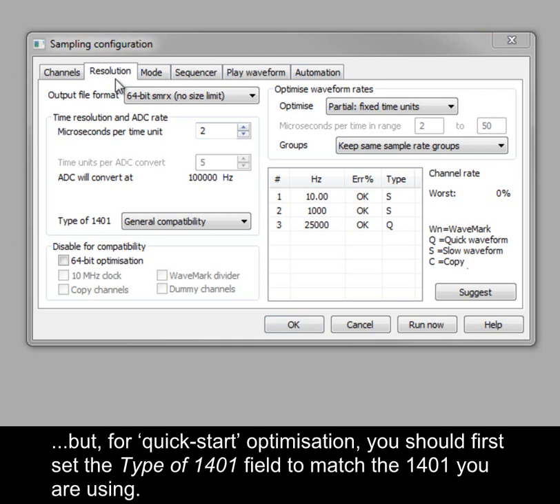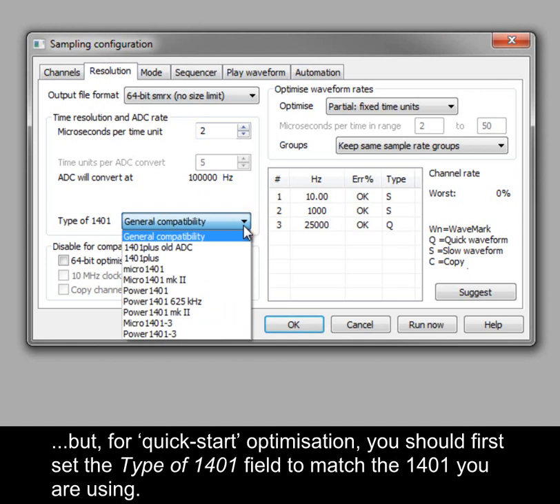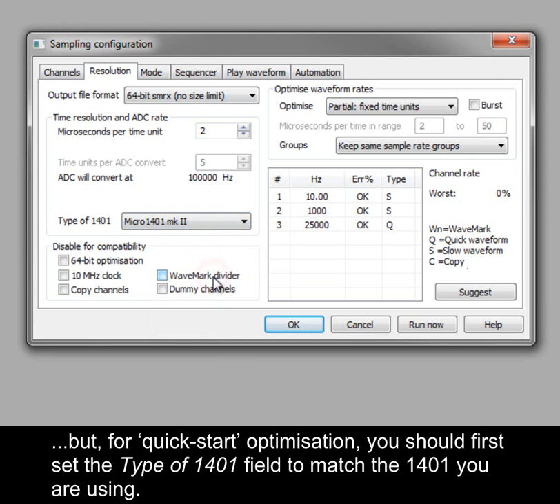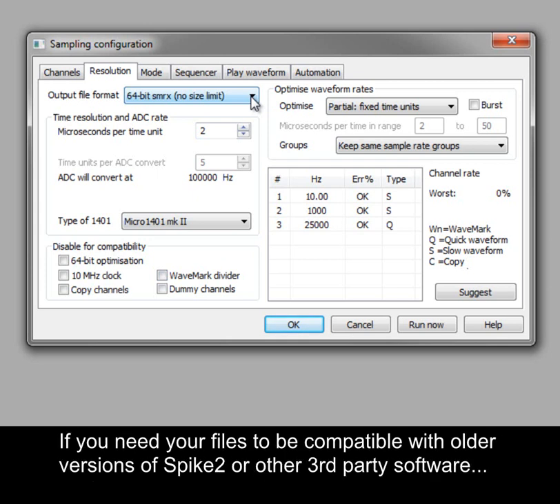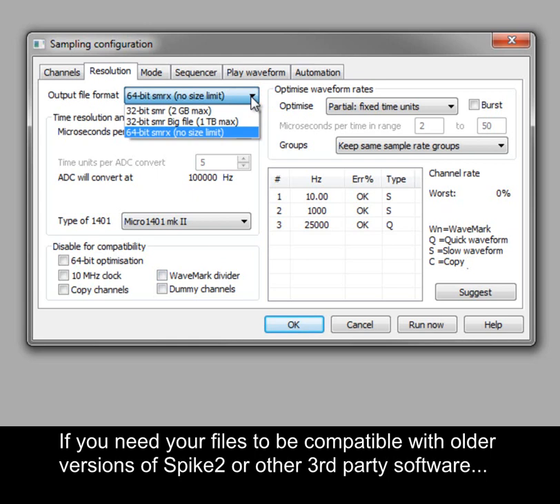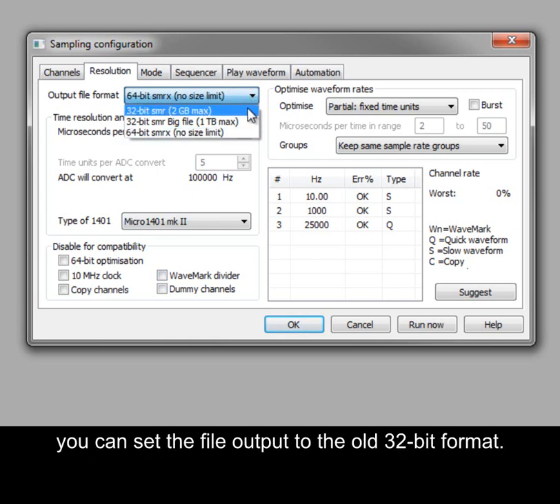But for quick start optimization, you should first set the type of 1401 field to match the 1401 you are using. In Spike2 version 8, the default setting is to sample to 64-bit data files, which allow both high timing resolution and long runtimes. If you need your files to be compatible with older versions of Spike2 or other third-party software, you can set the file output to the old 32-bit format.